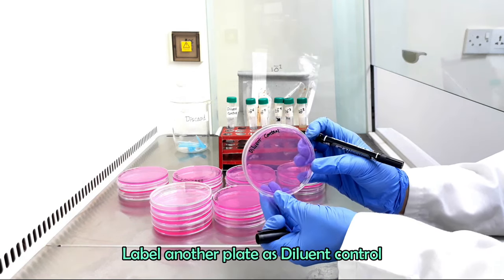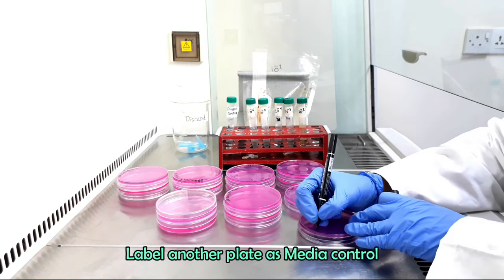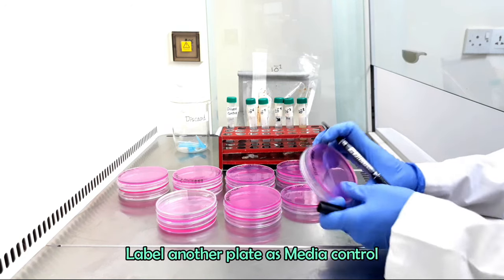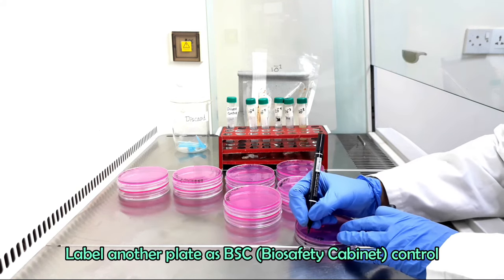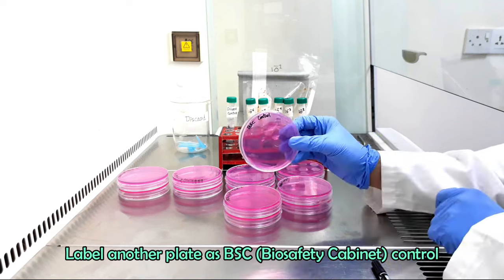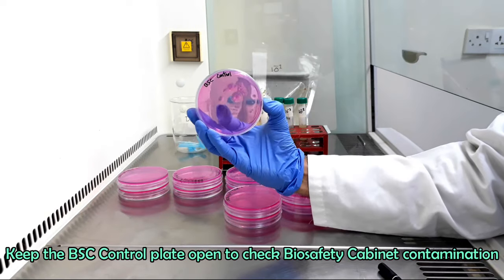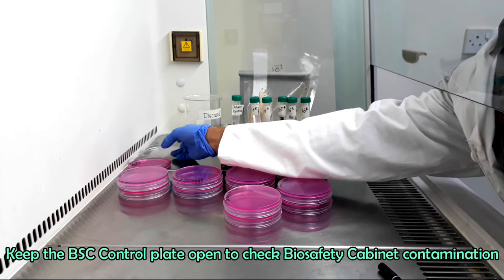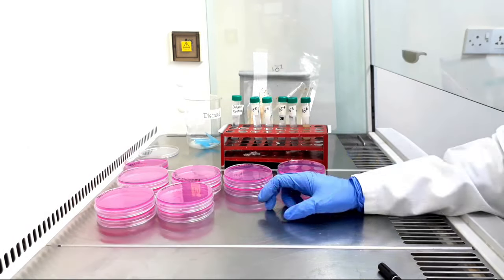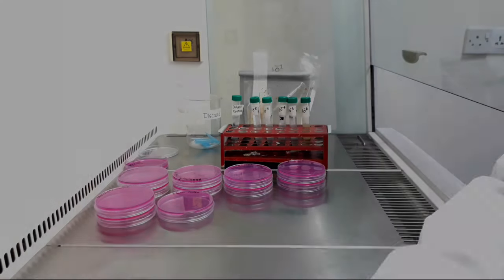This plate is for diluent control. This plate is for media control. This plate is for biological safety cabinet control. Keep the biological safety cabinet control plate open during all the time of working inside the cabinet. Media control plate contains only media, which is for contamination check of that prepared media.